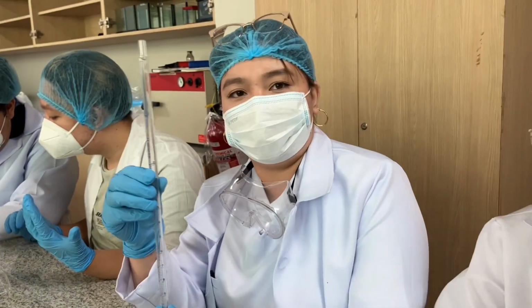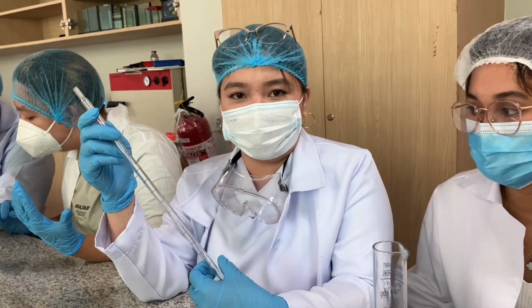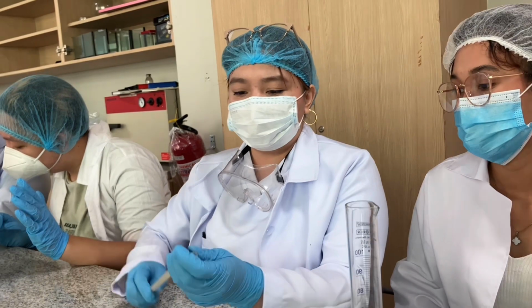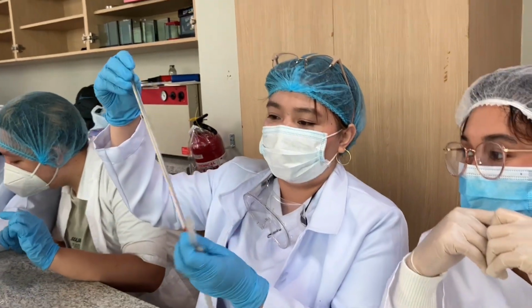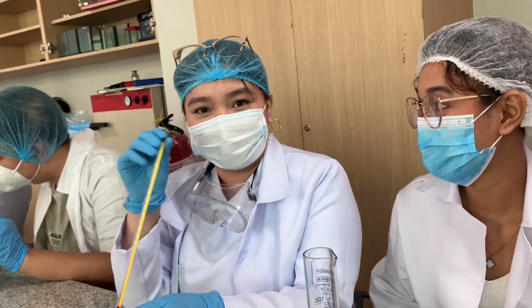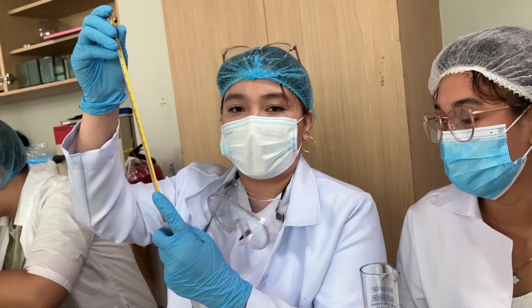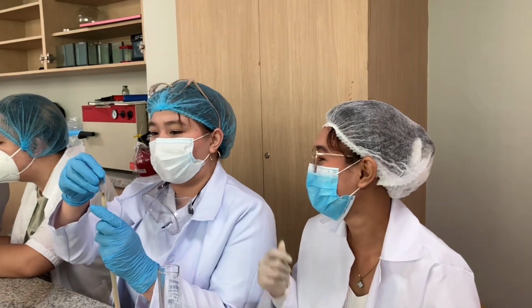Next one, this is called a pipette. This is used to transfer and get a precise measurement of a liquid during science laboratory experiment. And we have another one here. This is what we call a laboratory thermometer. This is used to measure the boiling point and the freezing point of a liquid during science laboratory experiment. Thank you. How about you guys?